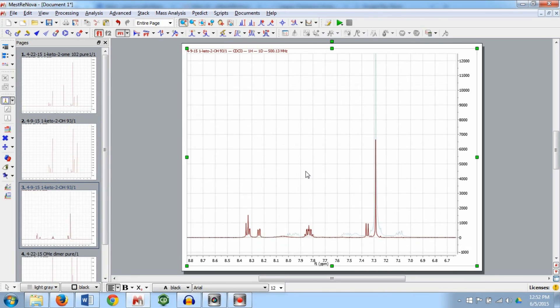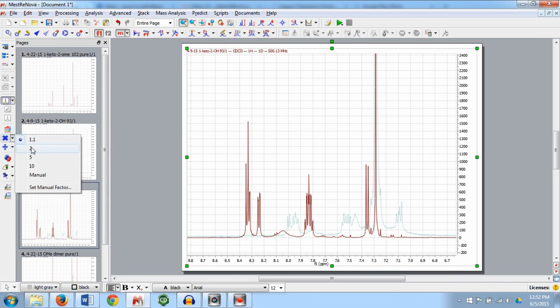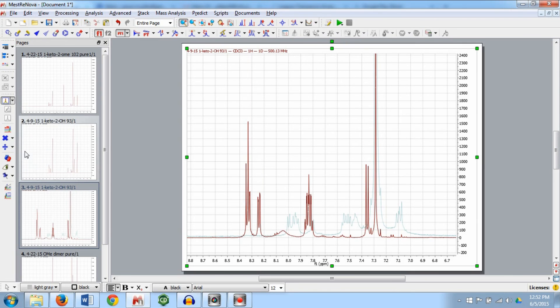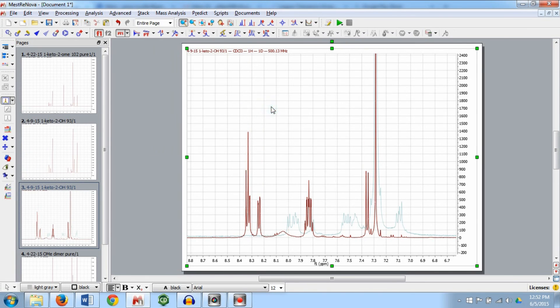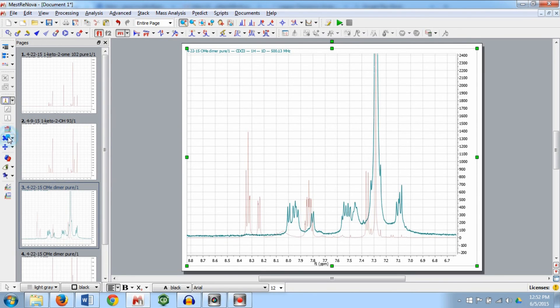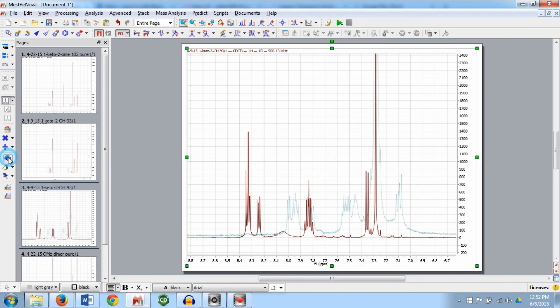When stacking or superimposing spectra, you may need to scale one spectrum more than the other. You can do this by using the Multiply and Divide tools on the left side of the screen or under the Stack menu option. To switch the spectrum in focus, use the Invert Order button on the left toolbar or in the Stack menu.